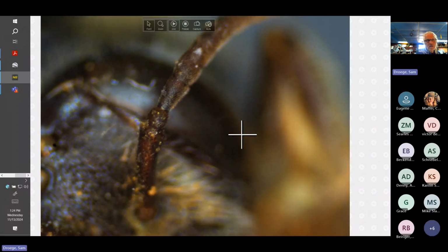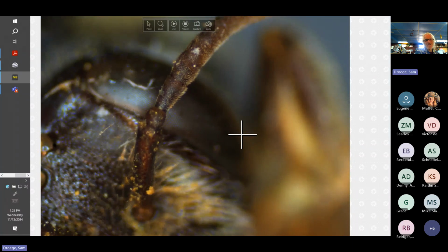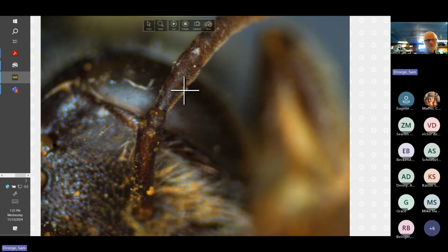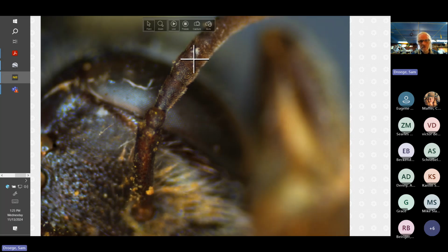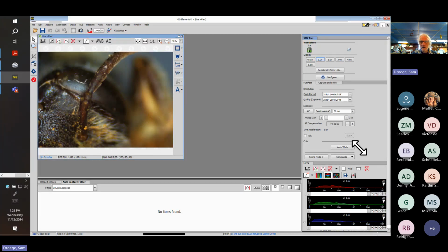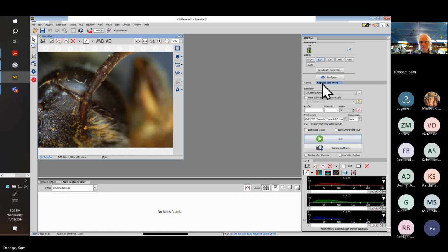All right, so if we look here, again, we get into that situation of comparison. Here's F1. We're at high magnification 2, and this is F2. I'm going to bump the light up here to get a little more of an idea about this feature.